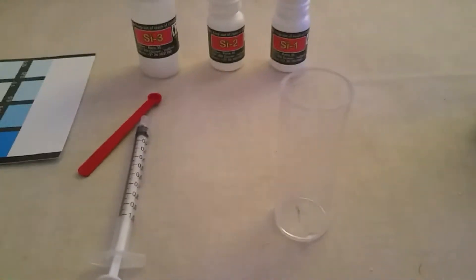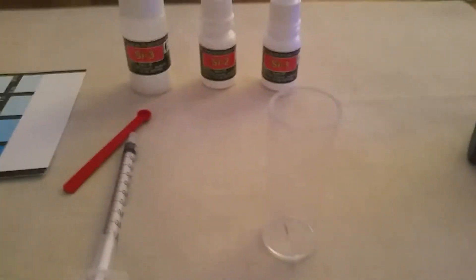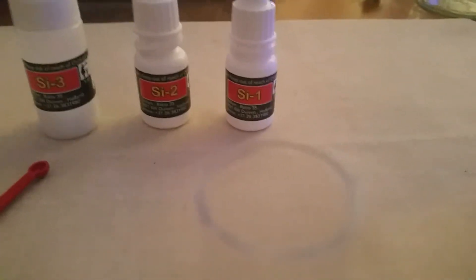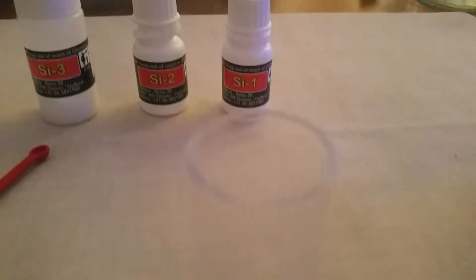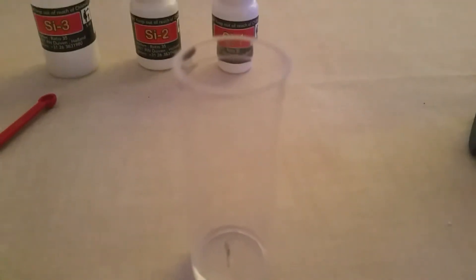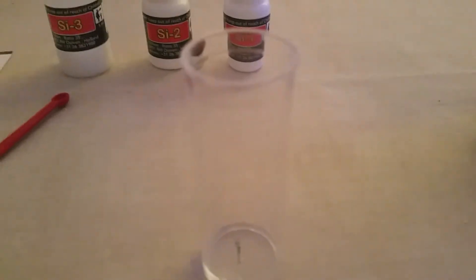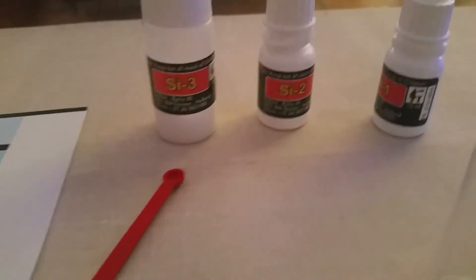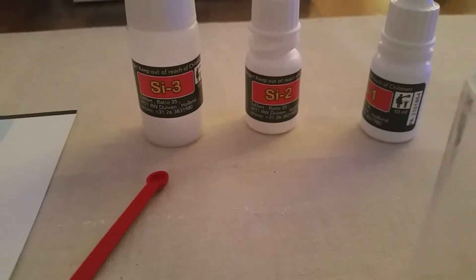First, I'll add 1ml of tank water. As you can see, there is one ml of salt water. I'll add four drops of SI1, shake it for 10 seconds, and wait five minutes.